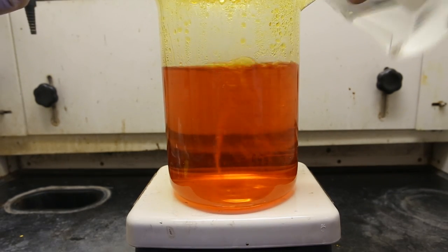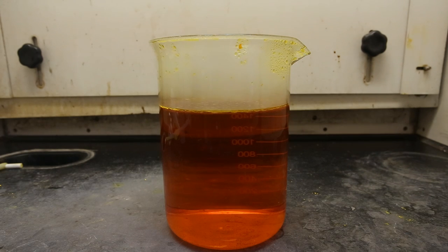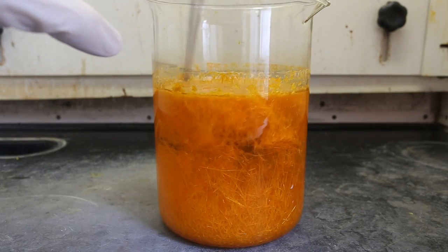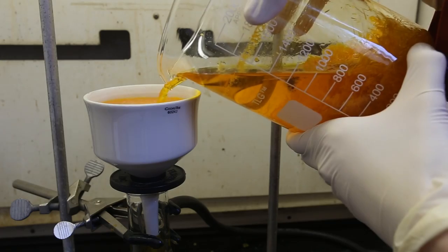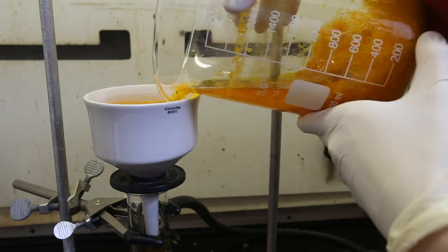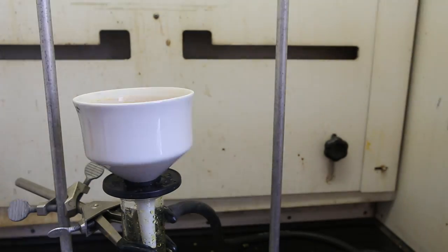The ethanol recrystallization will use about a tenth of the solvent, will boil much quicker, and will actually allow for a separation of the ortho isomer from the para isomer. This is what the crystals looked like after the solution had cooled to room temperature. The crystals were loosened up with a spatula, and then I vacuum filtered the solution. The beaker containing the crystallized product was washed several times. The precipitate was washed twice with 100 milliliters of ice-cold water. Afterwards, the product was left for a while to dry under vacuum.